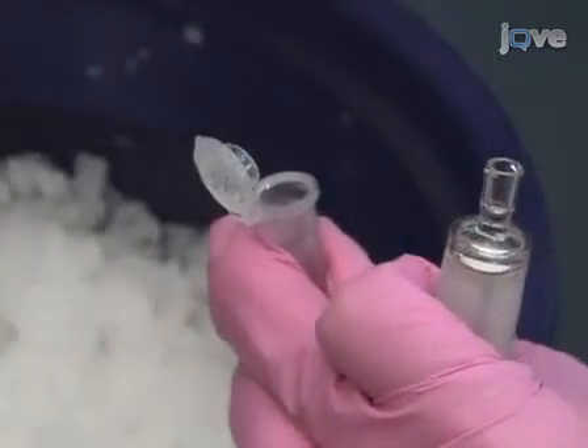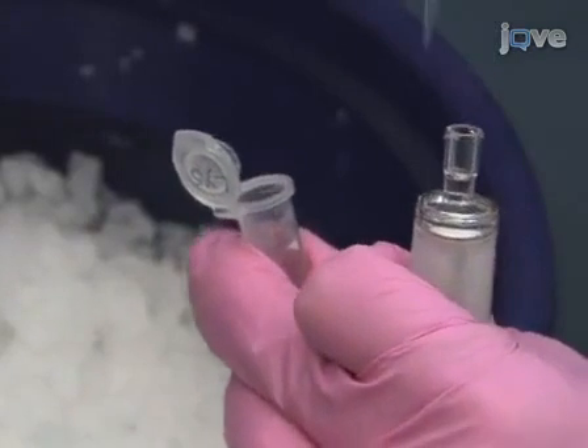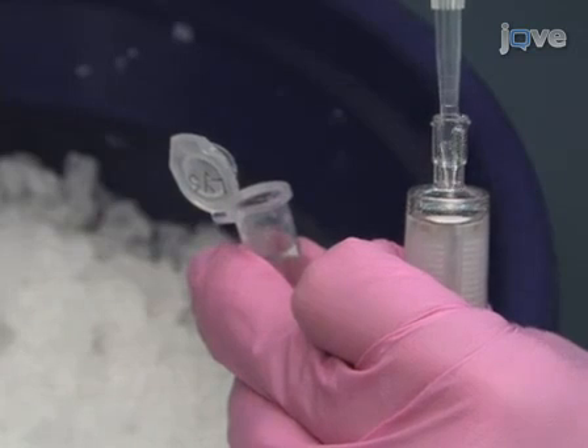Once the filter has thawed, begin the first of two incubations: one to lyse the cells and remove RNA, and one to break down proteins.